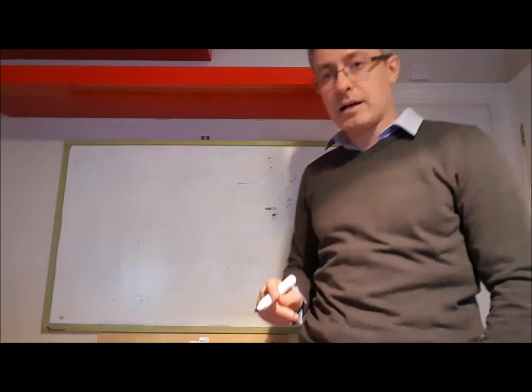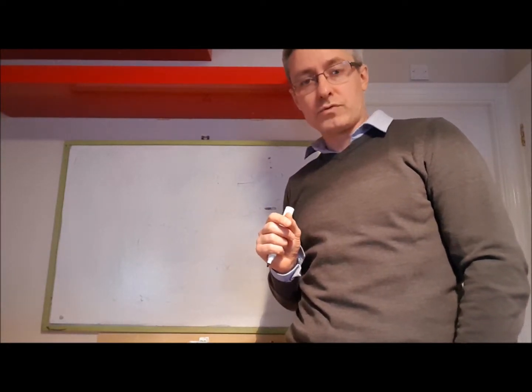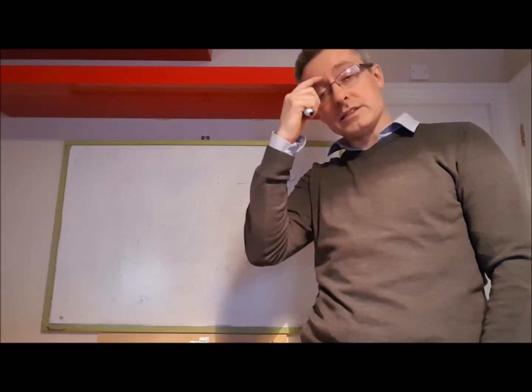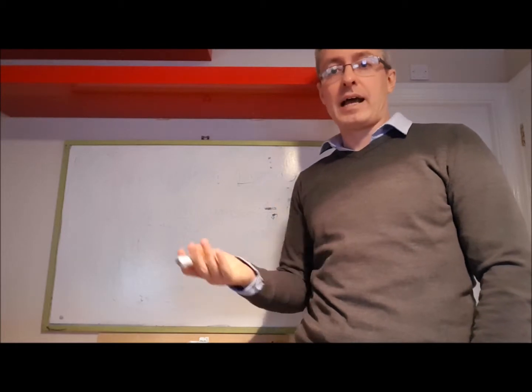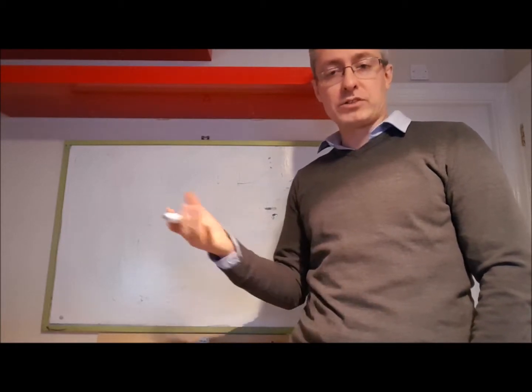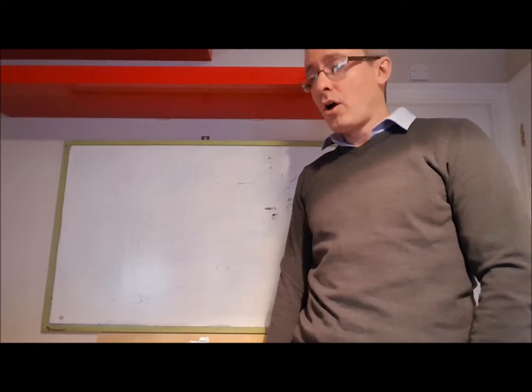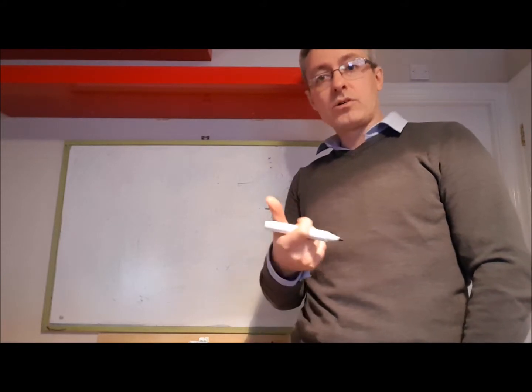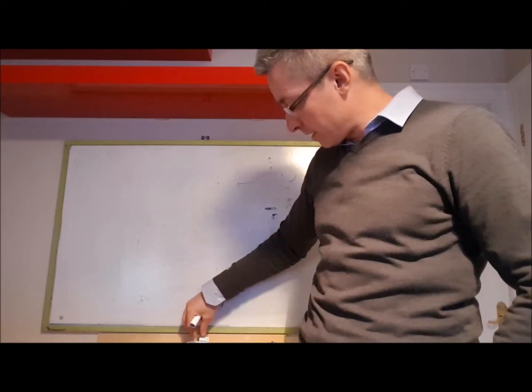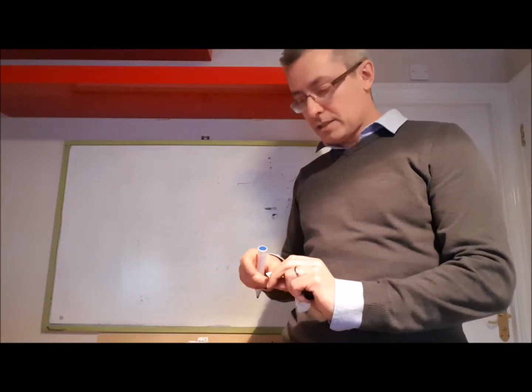So I'm thinking about these kind of thick film electrode systems being used for engine oil analysis, and I'm thinking there's sort of three ways of analysing an engine oil. I'll think of a scenario like a degradation. I want to monitor the degradation of an engine oil. One way of doing it, these are all opinions by the way, is conductivity.